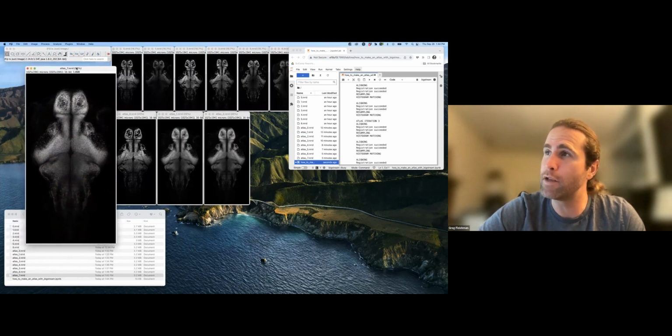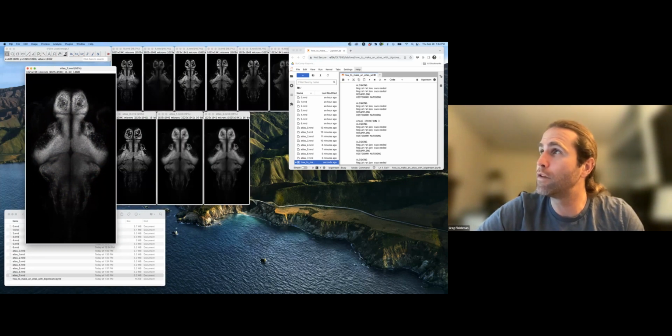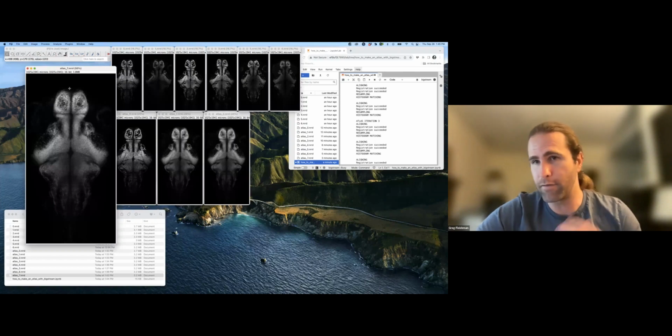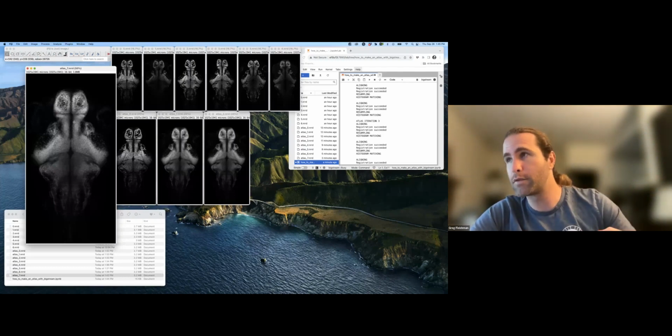Once you have this image, I would take Atlas 7 here, and this would be my study-specific template. All of my individuals' data, samples 0 through 6 up here, they are all registered to Atlas 7 by default. That was part of building Atlas 7. So now, if I want to average other pieces of data that I have from these 7 subjects, I can use those transforms to put everything into the common template coordinate system and do that averaging.